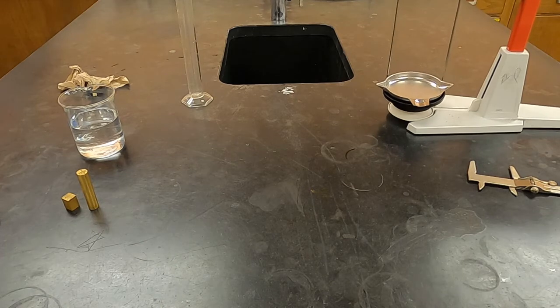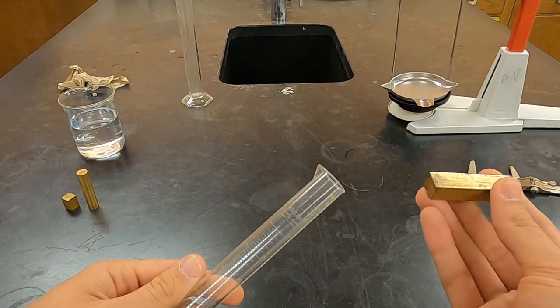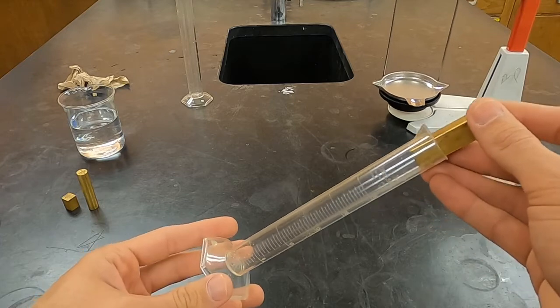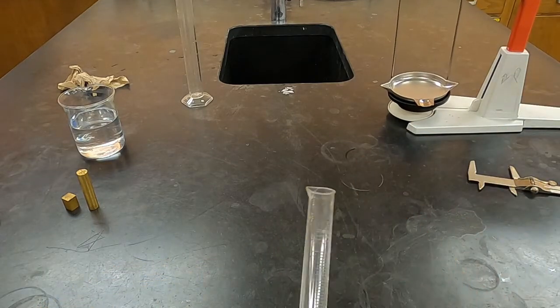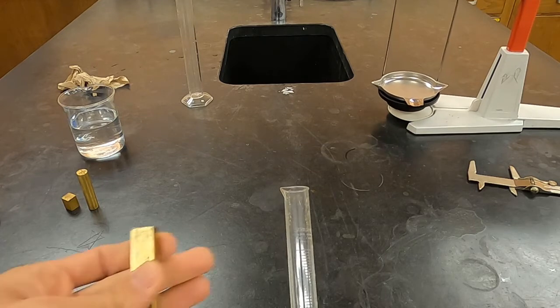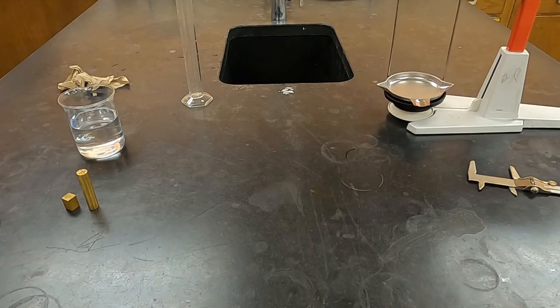All right, so I ran into some trouble when I was using the 25 milliliter graduated cylinder with these pieces of metal. I went to put in this rectangular prism after I'd carefully measured the water, and it got stuck. So make sure ahead of time that you're using a graduated cylinder that will fit your pieces of metal. I already did this piece, didn't record it, but I'll show you how that works. You're going to use at least a 50 milliliter graduated cylinder.